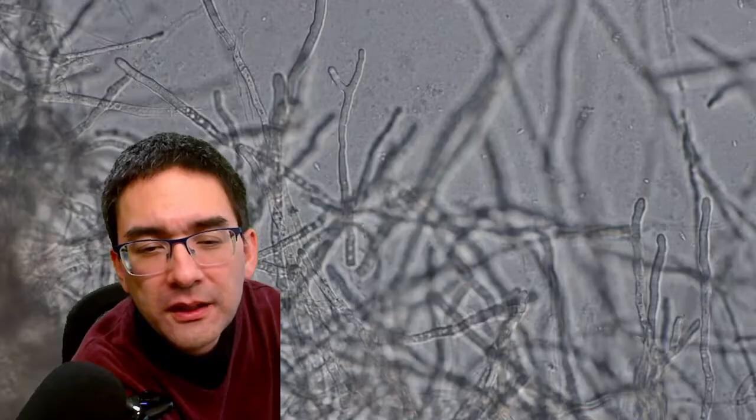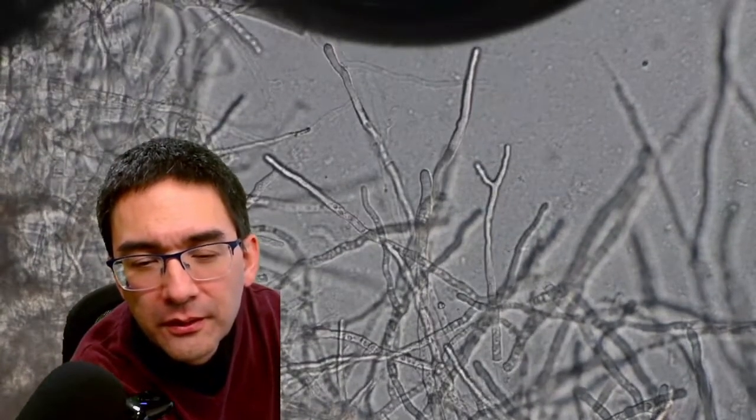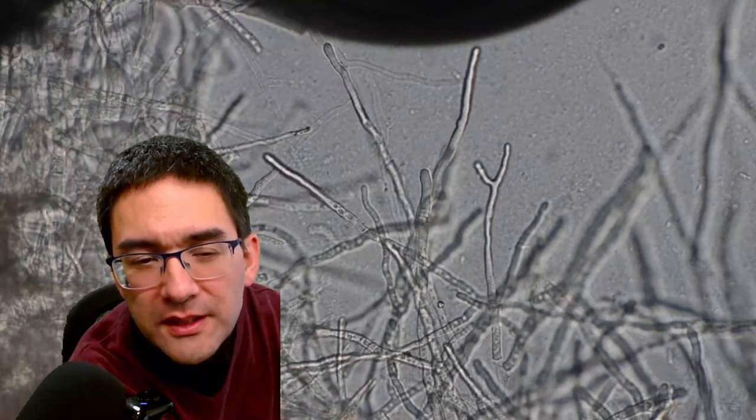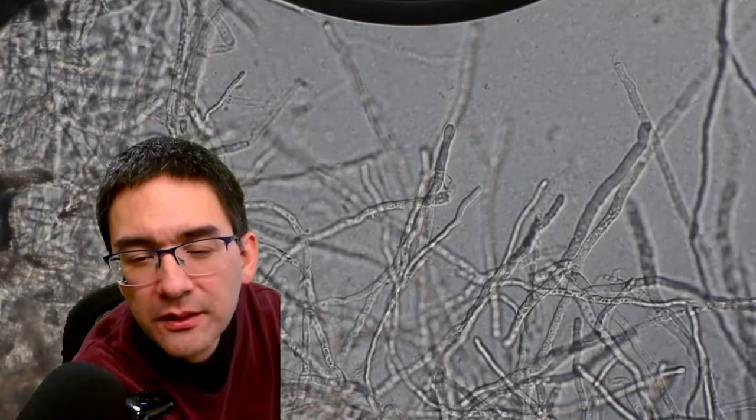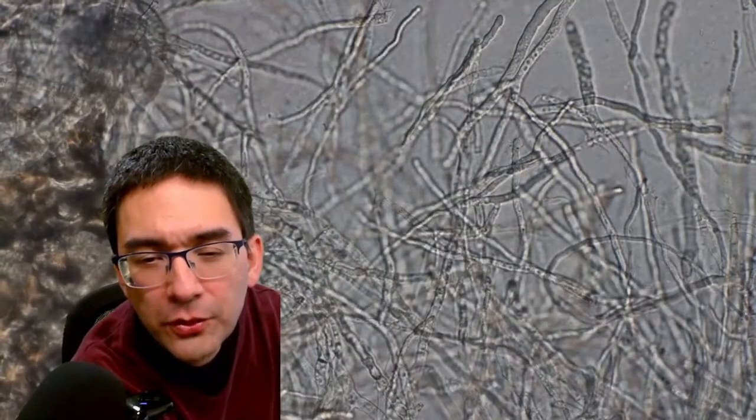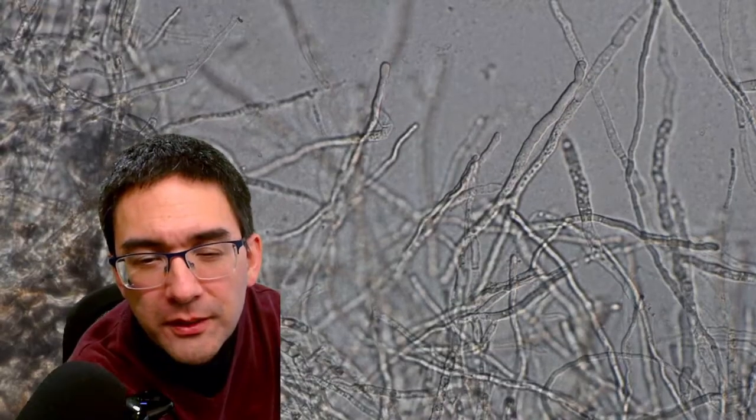So I think this might already be a little bit of a problem with staining if there's so much air in there. So from 20 to 40. Let's go up a little bit here. So basically that's it. If you look, you can see that it's also something very typical, the branching that you see over here. And another thing that you can see is that when you look into the cells you're able to see that there are little structures inside the cells as well. So in other words, you can see some cell organelles. So this is basically how it looks like. And what these do is they're able to fuse together. And then that's basically their form of sexual reproduction, this process of fusing together. And this is how DNA is mixed. And then out of that you have the fruiting bodies emerging.